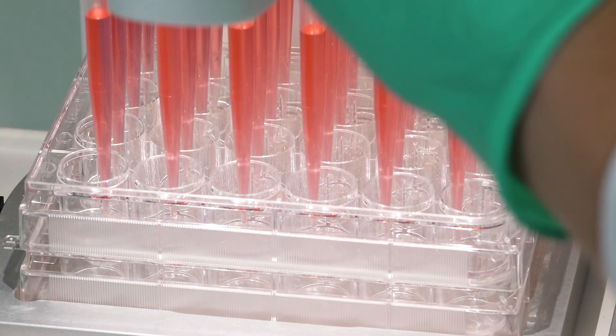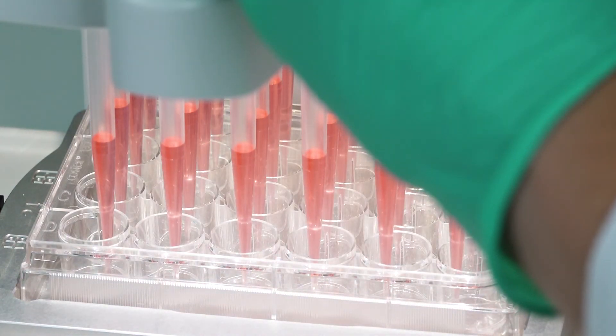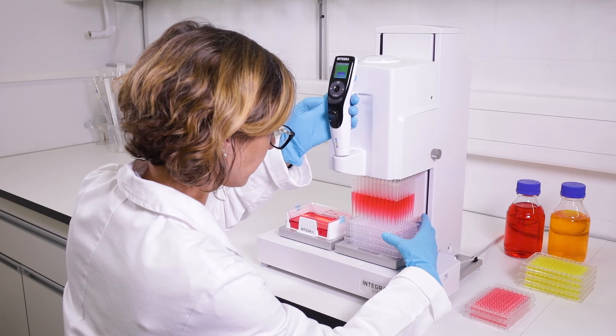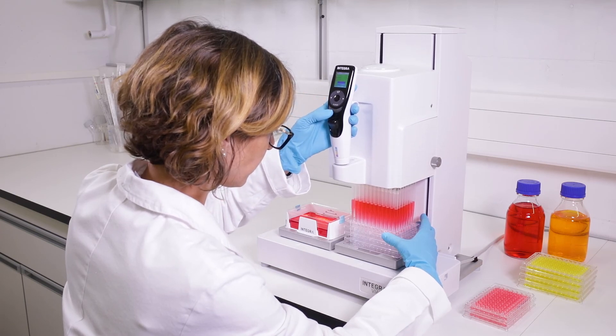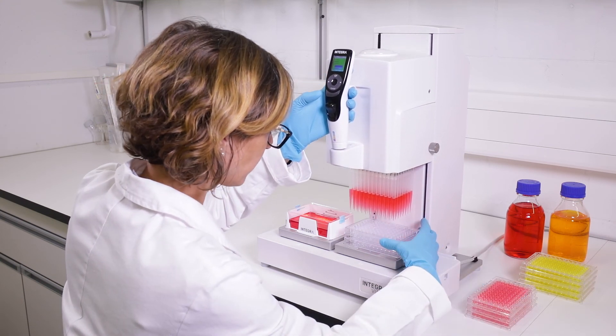For cell culture applications, filling 24-well plates can be done quickly and easily, using the 24-channel pipetting head. The hand-guided ViaFlow 96 and 384 are as intuitive and easy to use as any traditional handheld pipette.